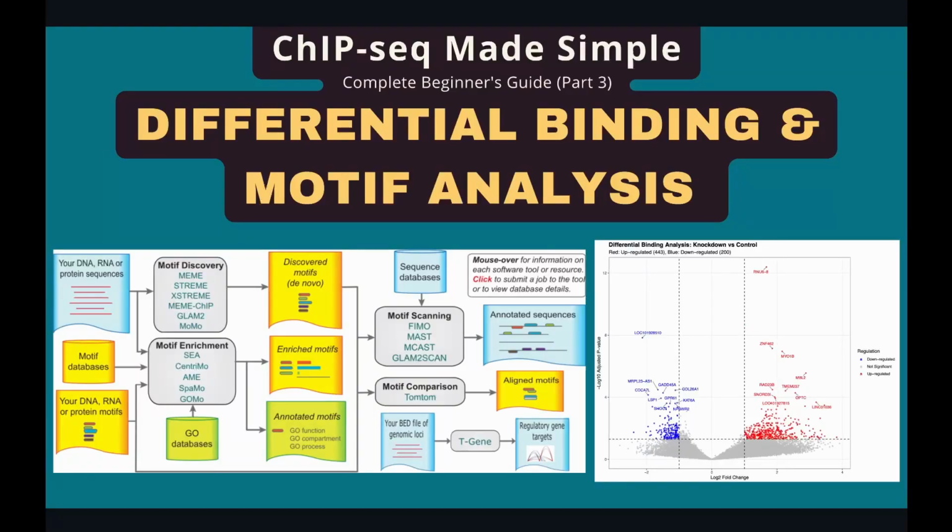In this video, I'm going to show you how to perform differential binding analysis and motif analysis in ChIP-seq data. Like RNA-seq data, most ChIP-seq datasets have multiple samples in different groups. So we can compare differential binding sites between groups.